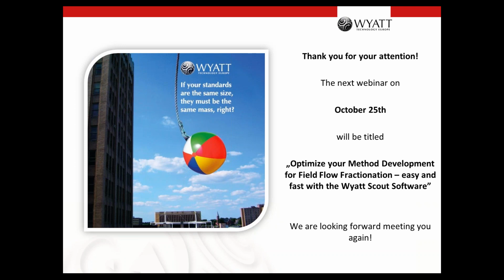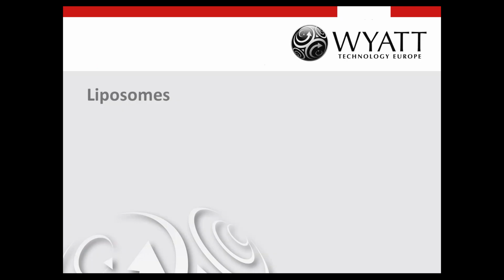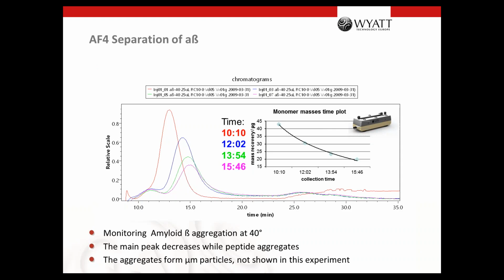Okay. The next question relates to one of our examples in the presentation, the retention time. Did the retention time shift over time for the A beta? Yeah, that's true. That happened. I can go to this example. You see here with time, you see a shift. And this shift is quite strong. So it's really a few minutes.